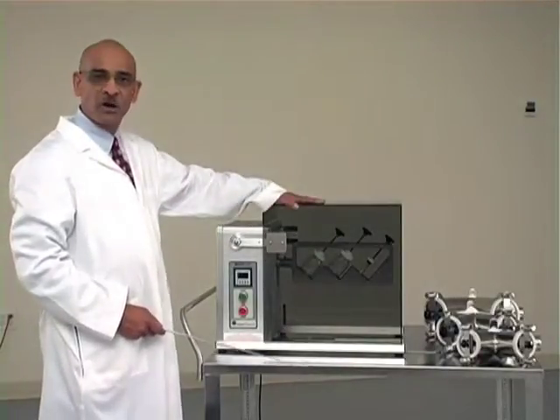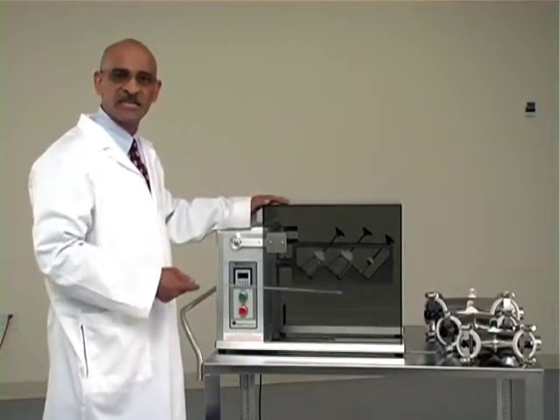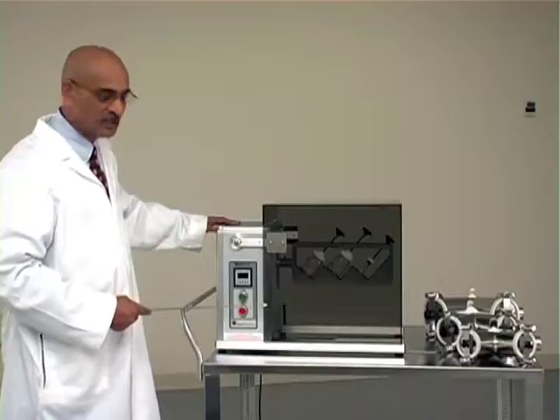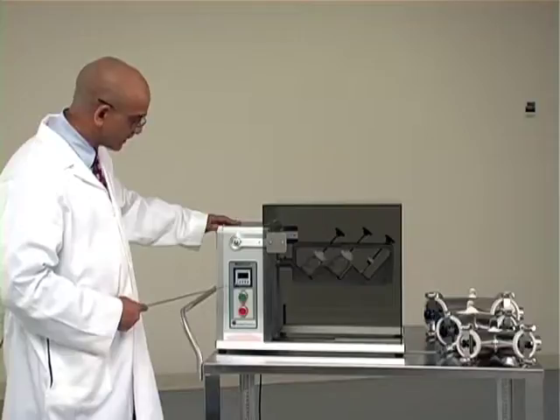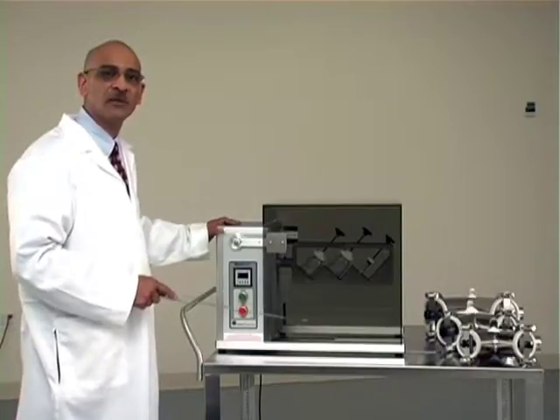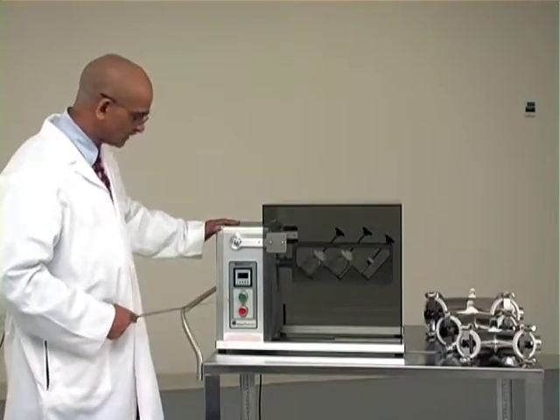This machine has a safety guard which, when it is raised, the machine will stop running — it is a safety feature. It has a timer where you can set the time of blending, a reset function to reset the time, and a lock function. Once you set the time, you can press the lock button to lock the blending time so you don't accidentally change it.